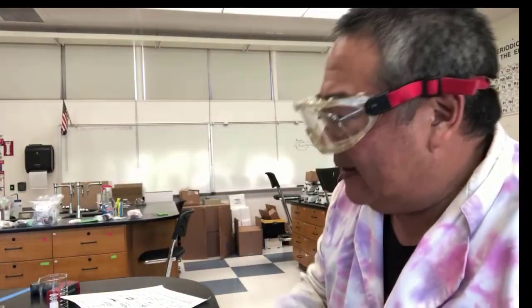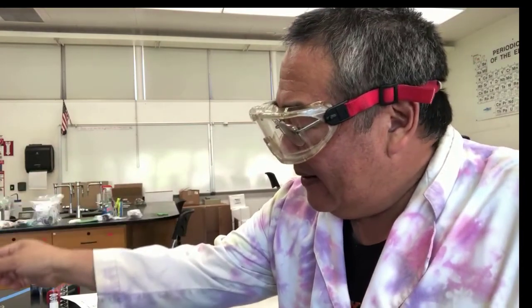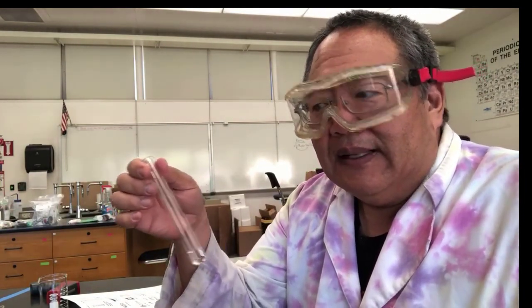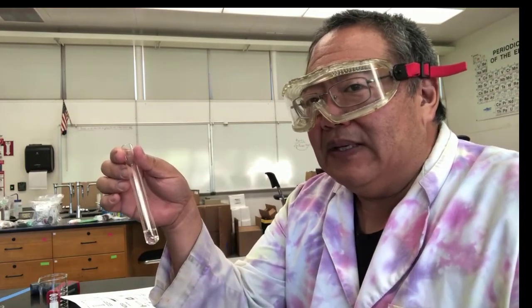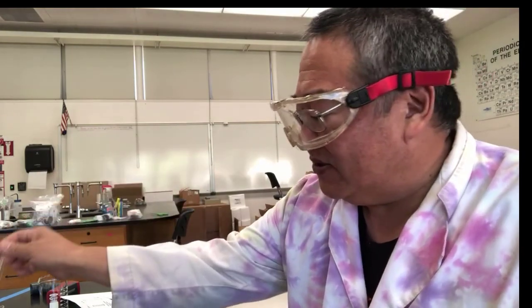So make sure when you're heating liquids in a test tube or heating liquids in general, if you're using an open flame, don't use flammable liquids. If you're heating it in a test tube, just make sure you're not pointing it towards somebody in case it bumps, okay? But the most important thing is just be attentive to what you're doing. Like you'll notice, it took quite a while for that water to bump out of there. You really have to not be paying attention. So pay attention to what you're doing, and these things don't usually happen.